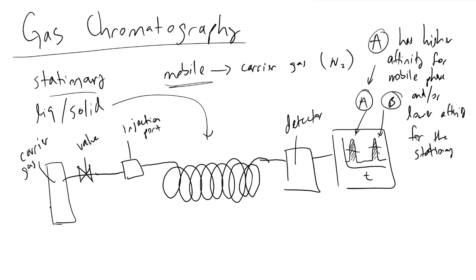And so if we think of chromatography like some kind of race between two molecules, if A is faster relative to B.